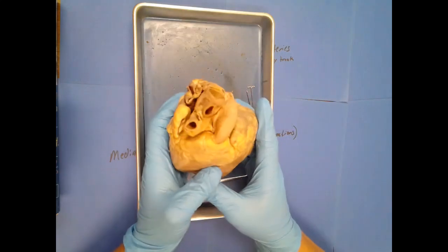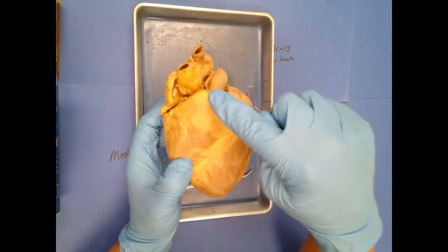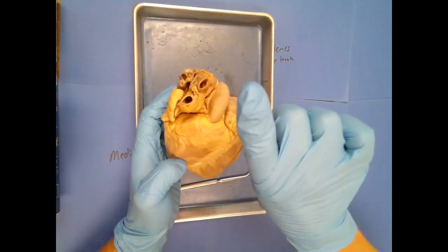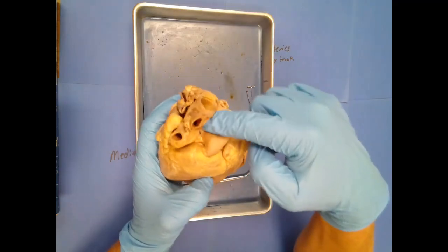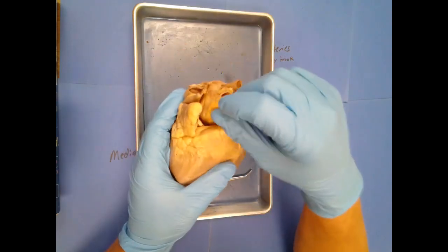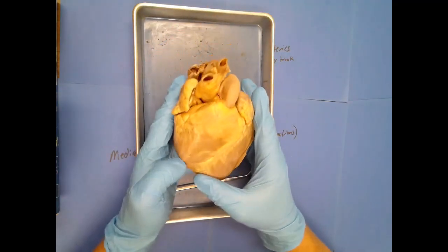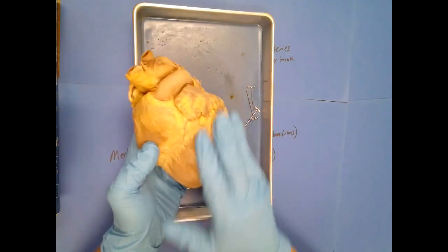Because this heart came from a quadruped, notice how the pulmonary trunk doesn't ascend much before it starts arching and bifurcating into the pulmonary arteries. In humans, the pulmonary trunk ascends and then bifurcates, and the pulmonary arteries go to each lung. The right pulmonary artery goes under the aortic arch, and the left goes straight to the left lung. Here we've got the ascending aorta, which then arches and descends on the posterior side of the heart on the way down to the abdomen. So again, that is the right atrium, the right ventricle, the left atrium, the left ventricle, and there's the pulmonary trunk and the aorta.